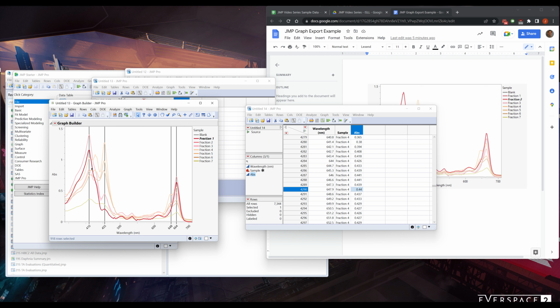We have a whole bunch of, what is degraded chlorophyll called? Pheophytin. Yeah, pheophytin. All right, so we have a bunch of pheophytin here. We see more pheophytin come out. See a little bit of chlorophyll B coming out. See less pheophytin, same amount of chlorophyll B, and now we see the big shift.